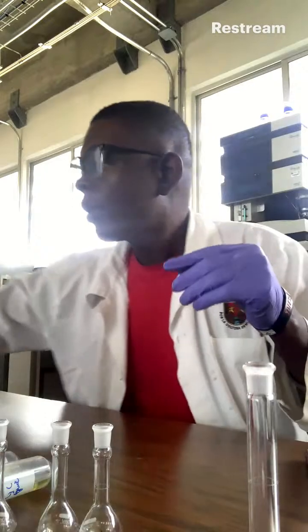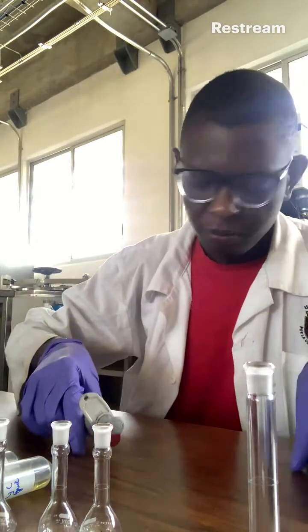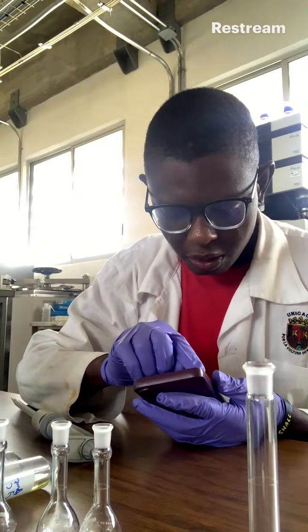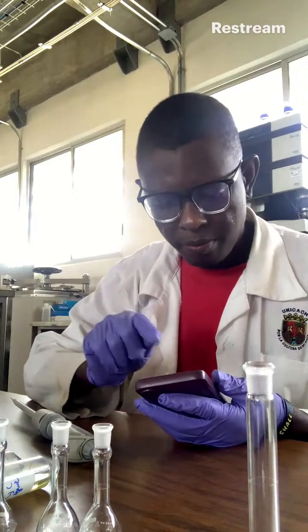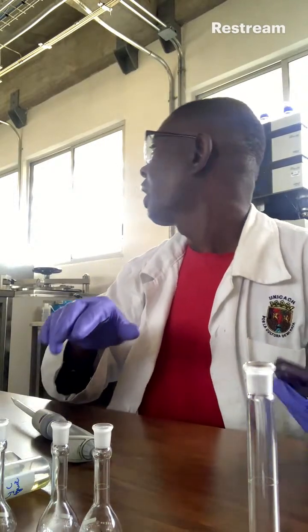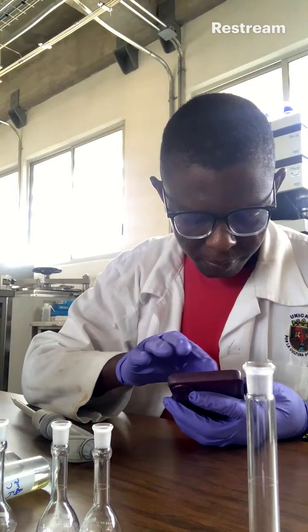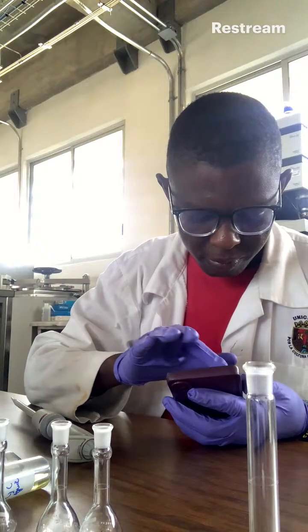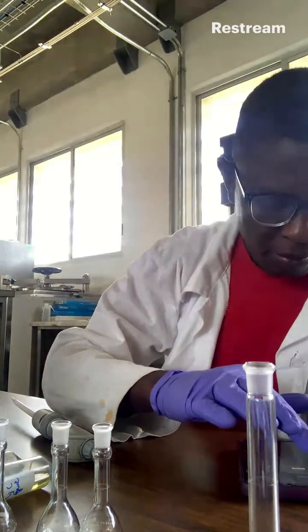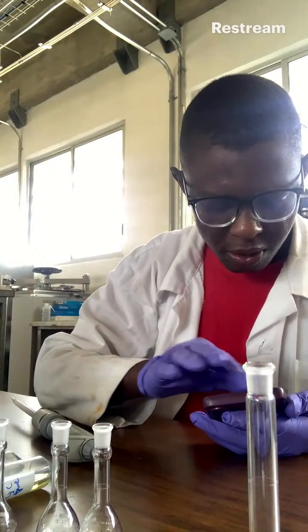First of all, I'll be using these pipettes to work with, and see how the sample will work out. So this is sample preparation.